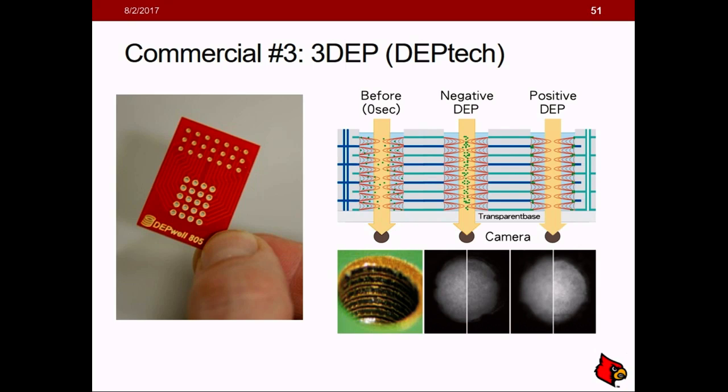So what happens is you inject your sample of all your particles, and if the particles experience negative dielectrophoresis at a particular frequency, they'll be concentrated in the middle. Just picture your interdigitated electrodes that we went over earlier, wrapped around in a well. This is a rather straightforward application of printed circuit board technology: you can have a layer of metal, a layer of insulator, a layer of metal, a layer of insulator.